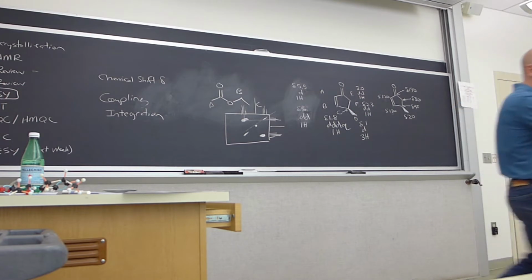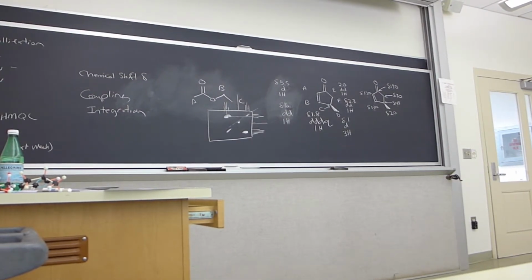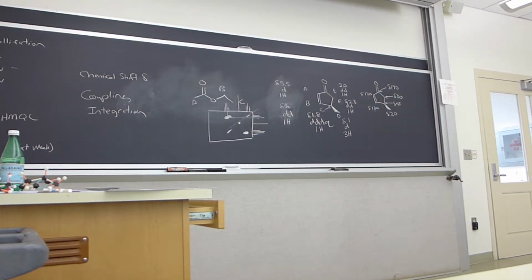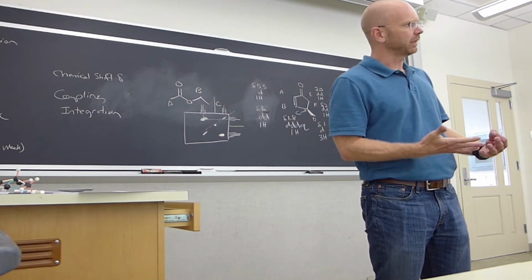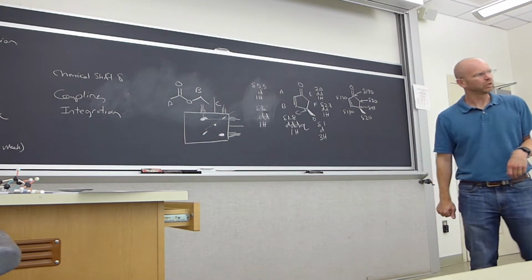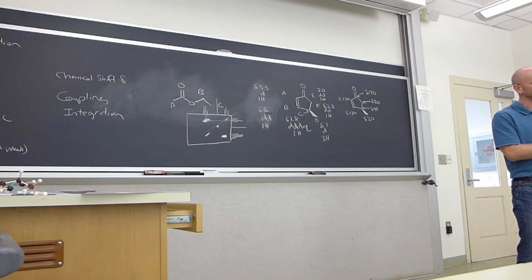If you turn to the COSY now, which is exposed to you, that's the COSY of ethyl acetate. See how that works? Any off-axis peaks are a coupling. Make sense? As the molecules get more complicated, you can see which two protons are coupling. If there are many, many proton groups and lots of coupling, you can tell exactly which two groups are coupling with one another.